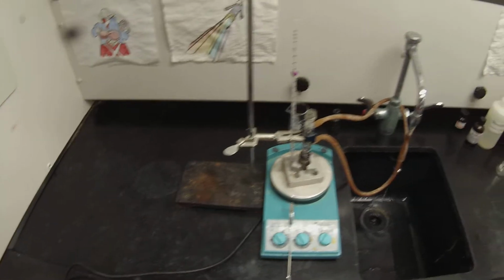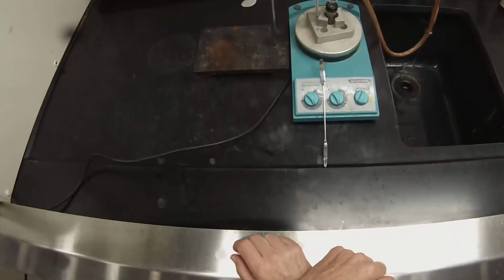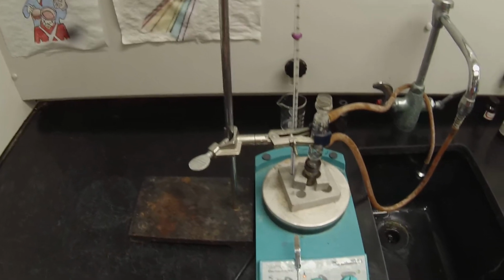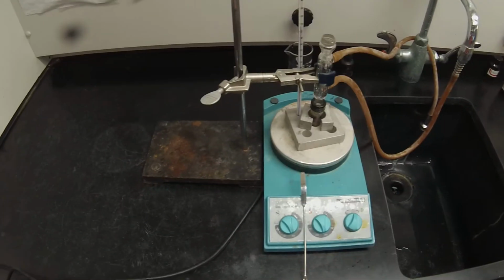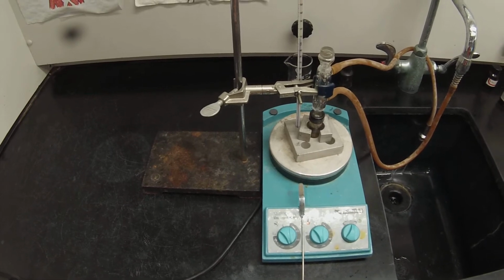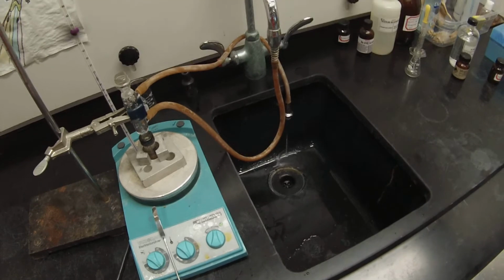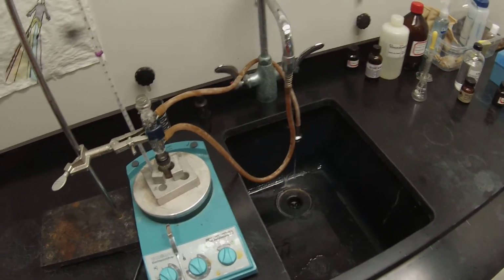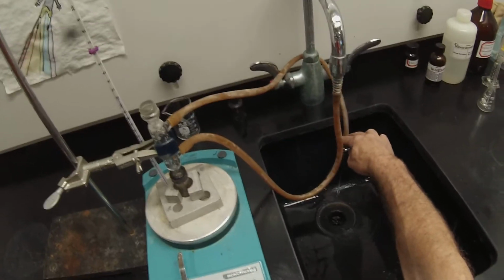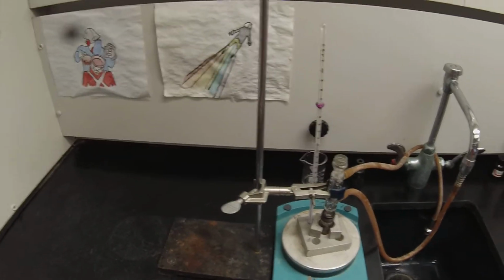Set that as a reminder that the block is hot. It shouldn't be touched. One thing about these sinks is they have a tendency to turn themselves off if you turn them down too low. So that's why I like to have the water where I can see it, rather than sticking it all the way down into the sink.